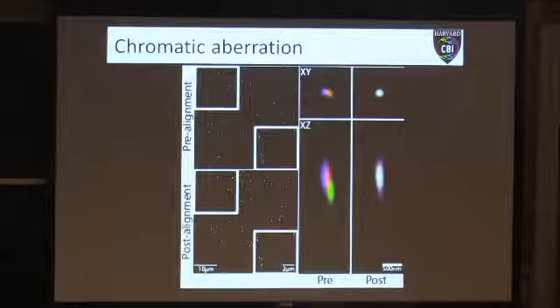If we take a look up here, you can see some of these beads look whitish, which is what they should be if the green, red, and blue are all aligned on top of each other. But if you blow up some of these, you actually have this little spread. This is one single bead, but you can see our light is spreading out.